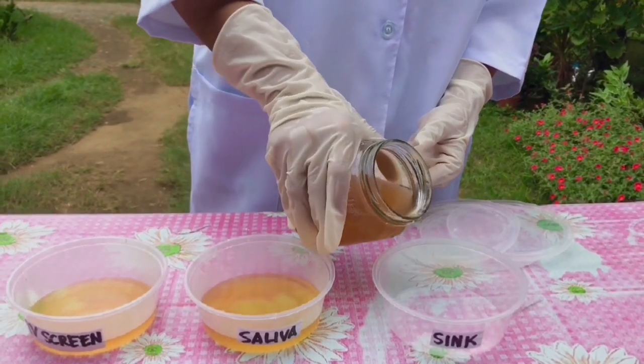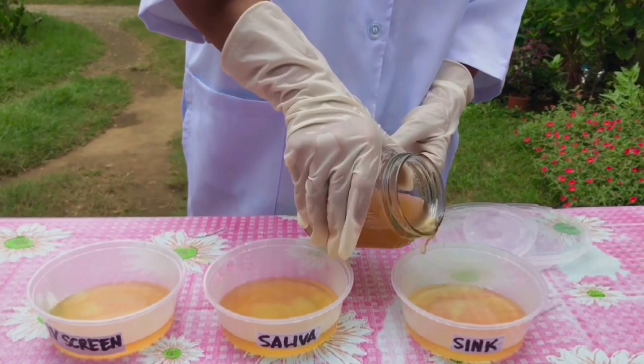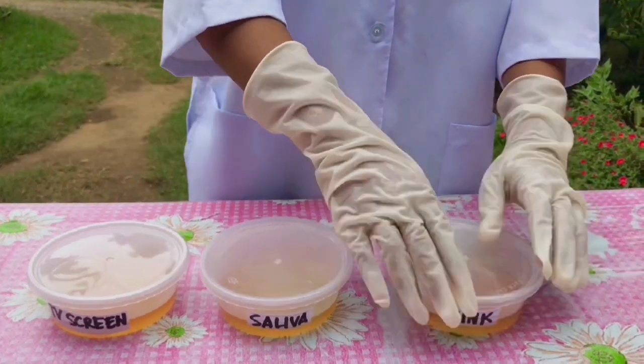I labeled mine: water/TV screen, saliva, and sink. Be sure to cover your Tupperwares or containers so that they cannot be contaminated by any bacteria.